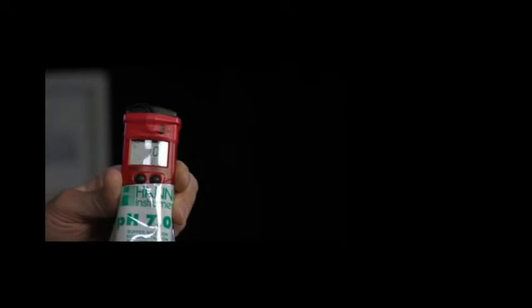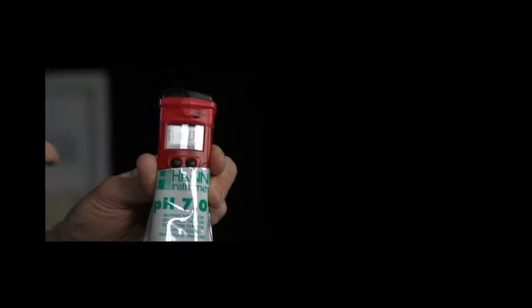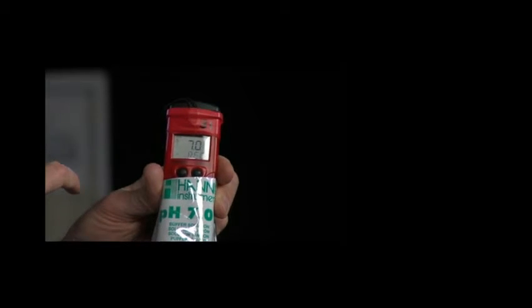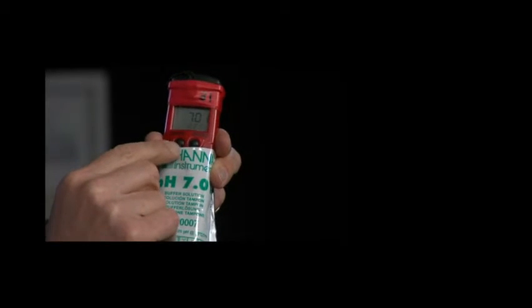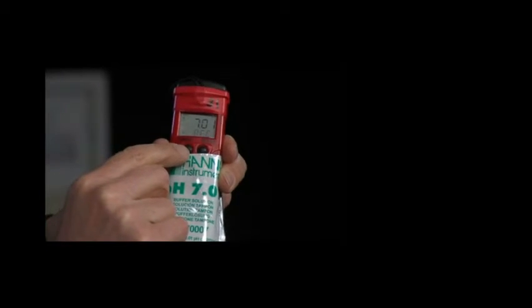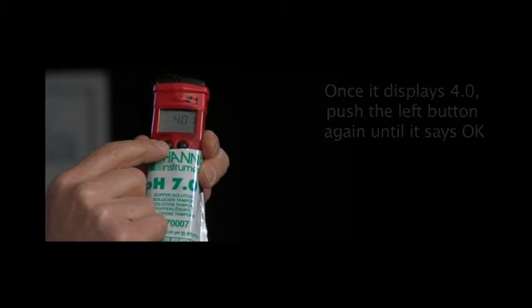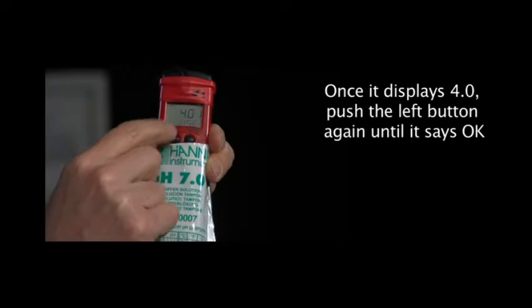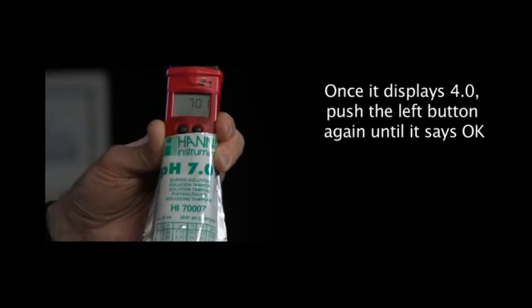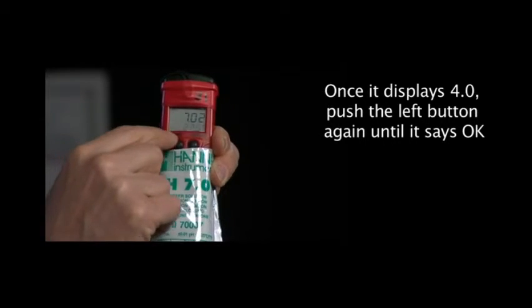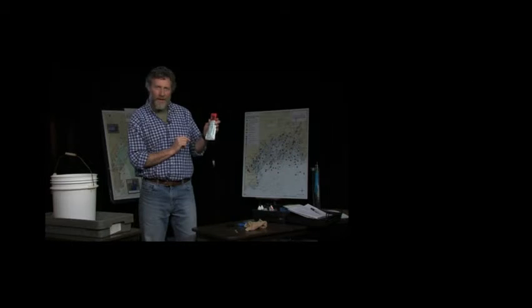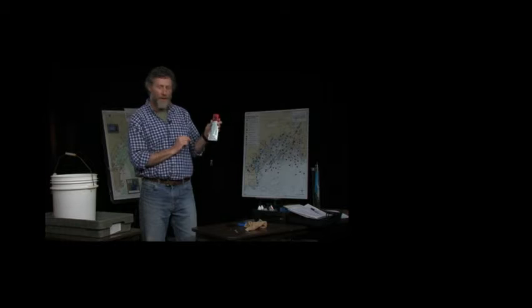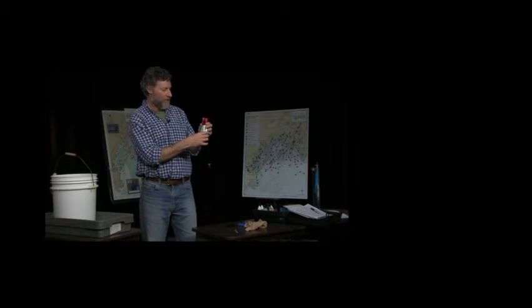The meter is going to say, I want to use a 4 calibration now because I like the 7. So it takes about a minute or so for it to get happy. It changed to 4. We'll push the left button once. Down at the bottom it said OK 1. Now we know that it's OK. It's been calibrated to this solution.